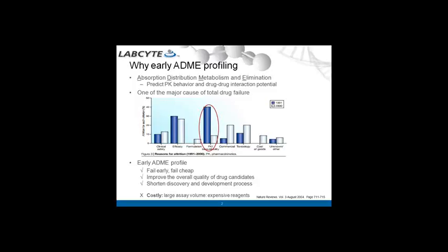However, running ADME assays in the early discovery stage still has a few hurdles to overcome. For one, liver enzymes and cells are DMSO sensitive. The assay volume has to be quite large to compensate for compound DMSO, or compounds have to be diluted in buffer first to accommodate a smaller assay volume. Some ADME assays are still being run in 24 or 48 well plates.